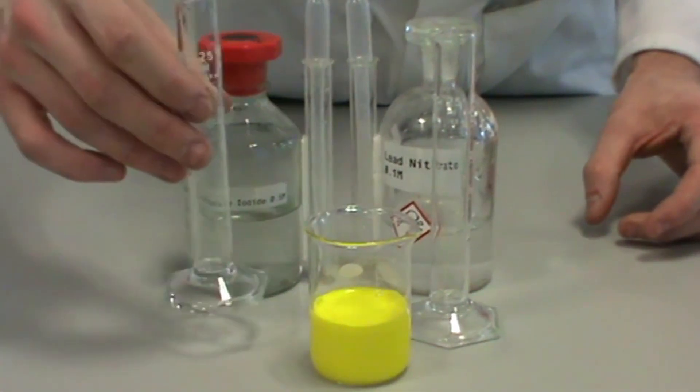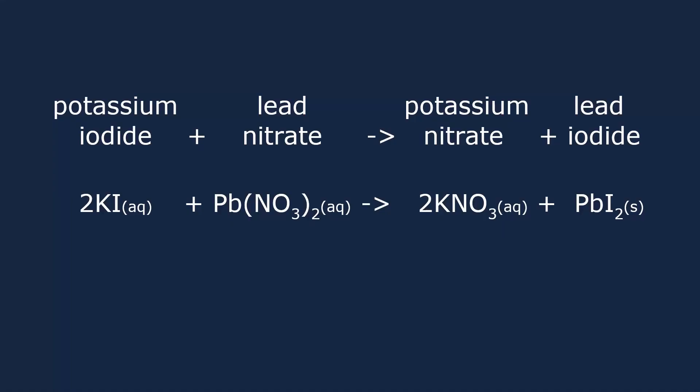You will see a yellow solid form. To form an insoluble salt, we need to mix two solutions containing soluble salts together.